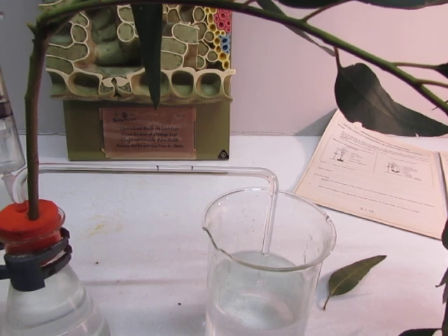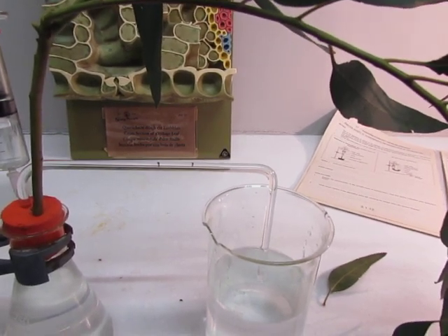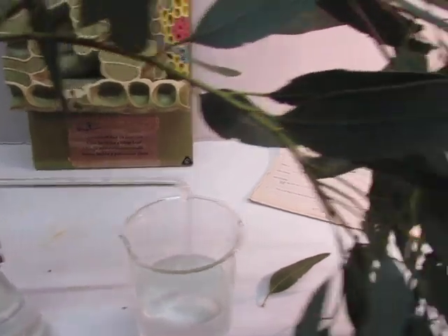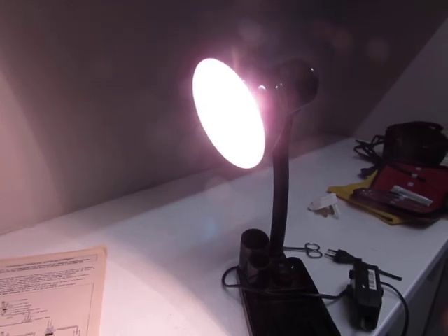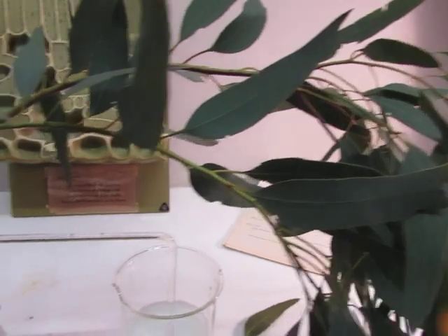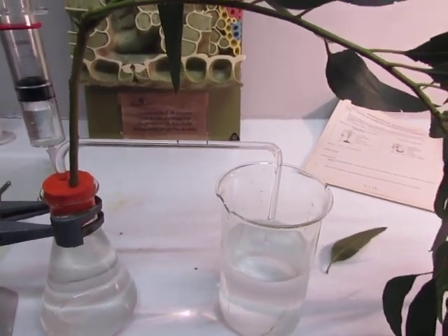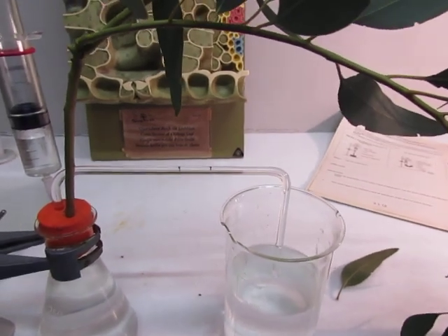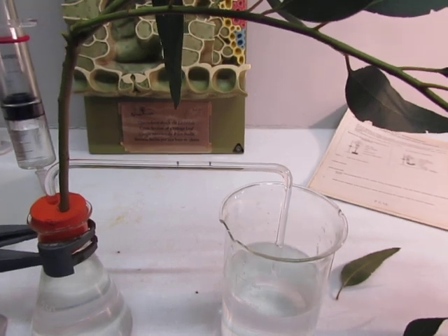I've mentioned the effect of light intensity, and we measure the effect of light intensity with an electric light. To increase the light, I'm using the light to record this, but under normal circumstances you won't have the light on while you're doing the normal measurements.